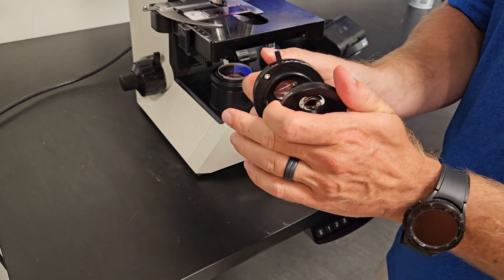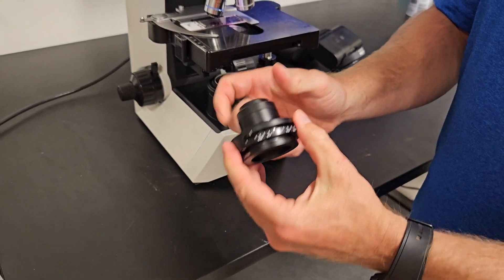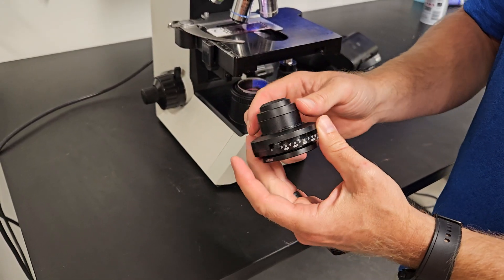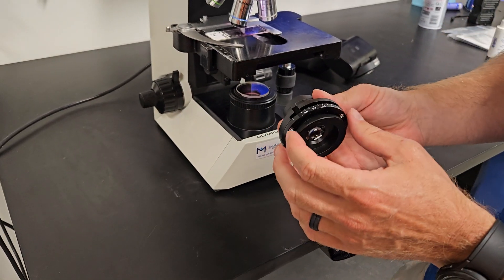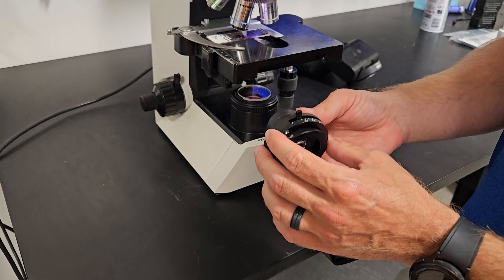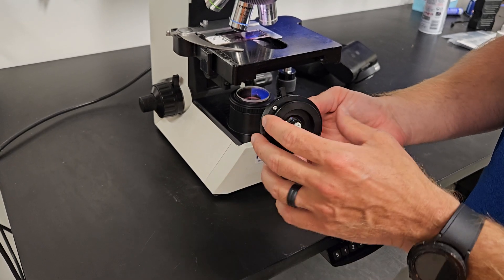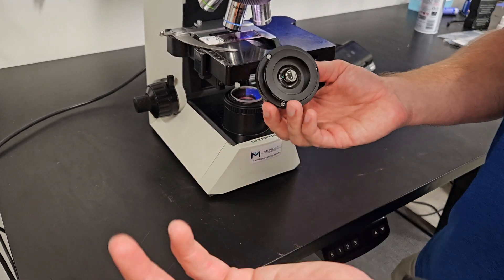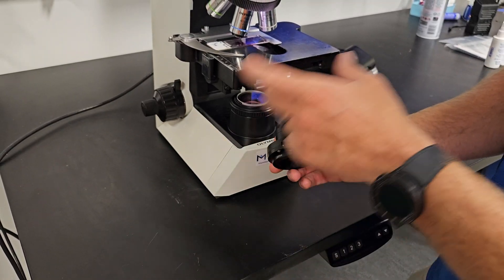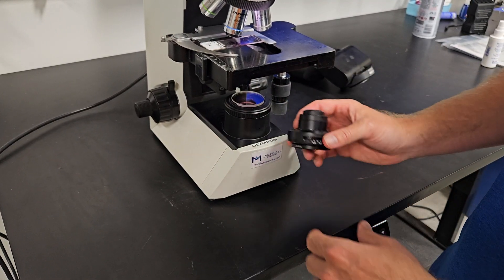You might see a cassette style condenser. It's going to have another position out here like this, and you can slide it back and forth, and it'll have a diaphragm built into one side. I like this one better. It's a lot easier to use for the pathologist. They don't really like sliding the cassette back and forth.